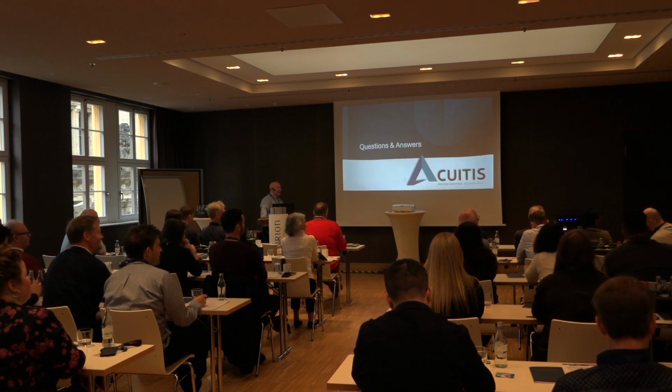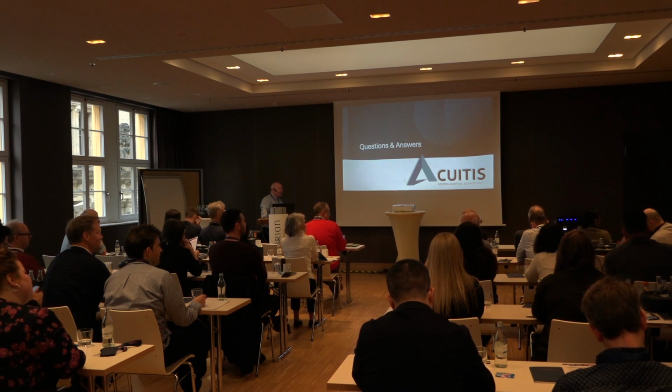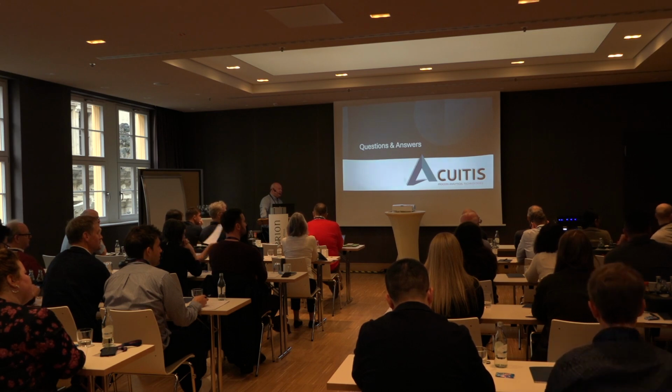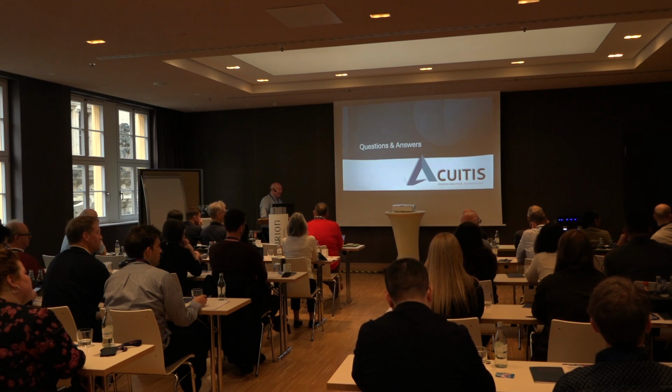Great talk. On the note of seeing lumps in blend, one question I hear a lot from customers is, what's the right size for the NIR spot size for blend analysis, because you're going to get more sensitive to scale of scrutiny at a smaller spot. Any thoughts on what the magic spot size ought to be?